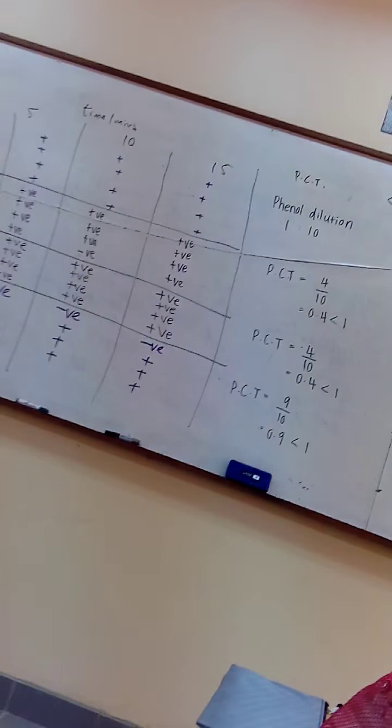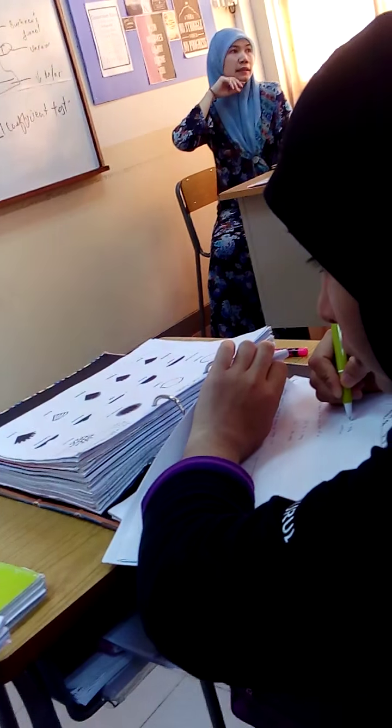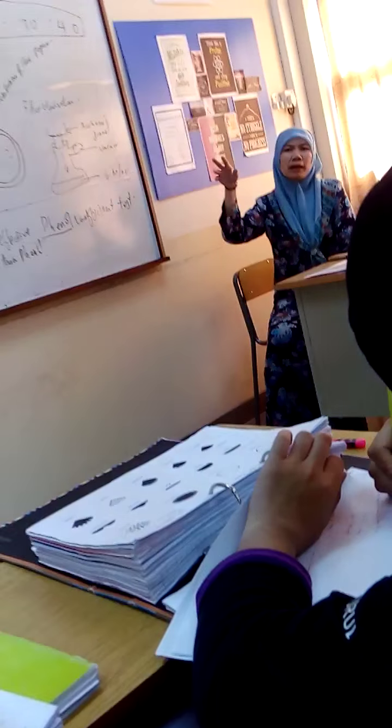It's a comparison, but as a conclusion, Dettol is the best one. And as a fault, phenol should be negative, showing a negative result, no growth, because it is the standard. For the other two, maybe they are less effective.